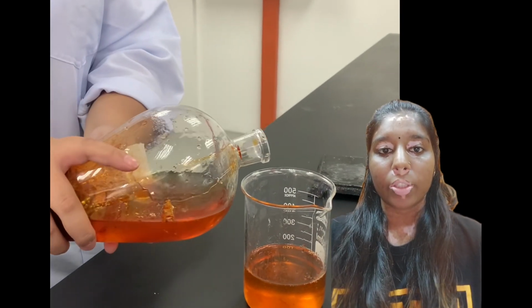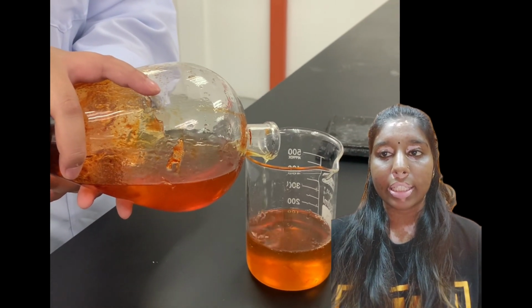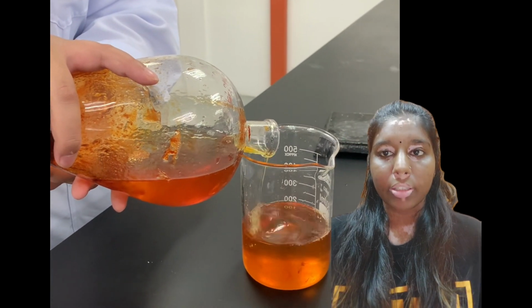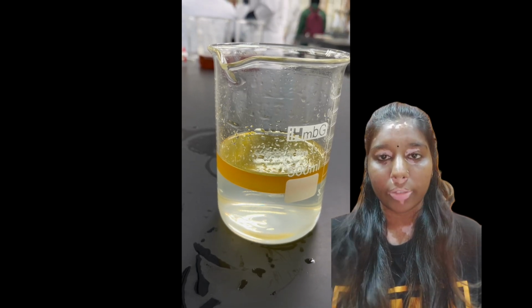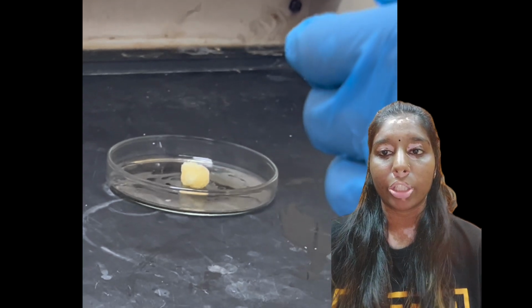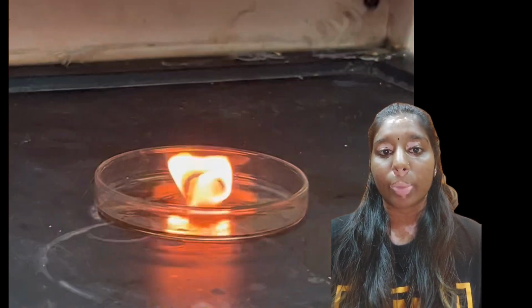After 24 hours of biodiesel production from used cooking oil, the biodiesel and glycerin were clearly separated. The top layer, which was made of biodiesel, was successfully washed using numerous washes of warm water. The final biodiesel ignited smoothly in the combustion test, and it produced minimal smoke, indicating the presence of biodiesel.